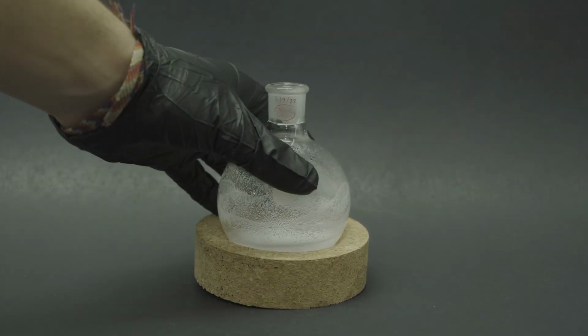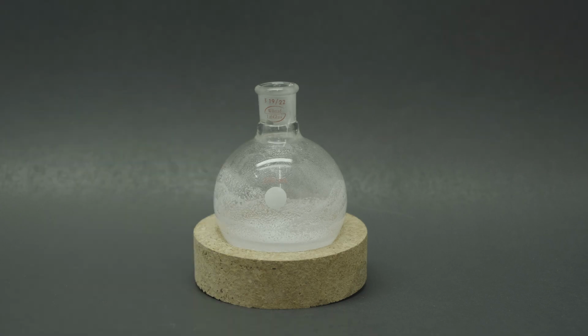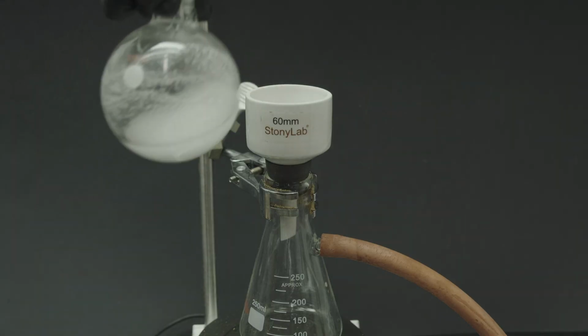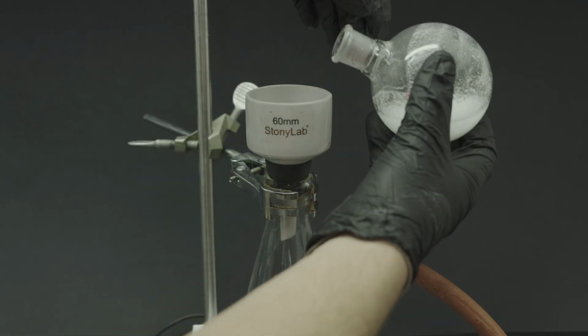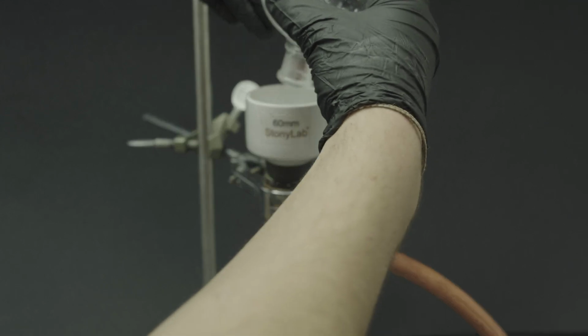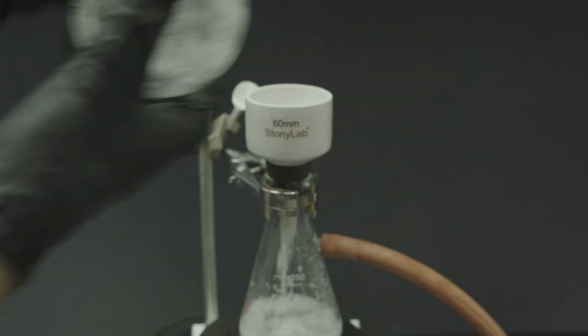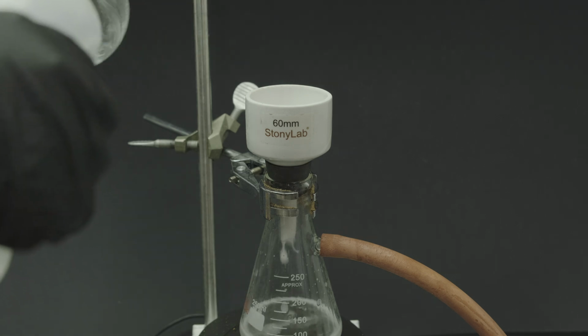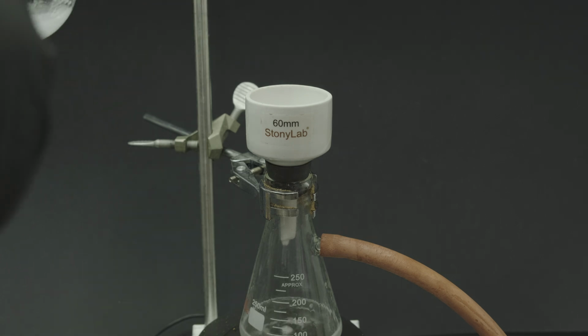I set up my vacuum filter and started pouring in what I hoped would be my aspirin. But as you'll see later in the video, I was getting my hopes up. I gave the flask an extra wash just to make sure that I got as much of my supposed aspirin as possible, and then dumped the whole thing.